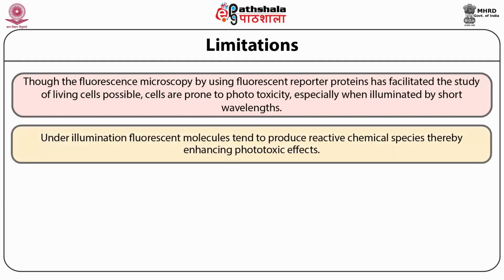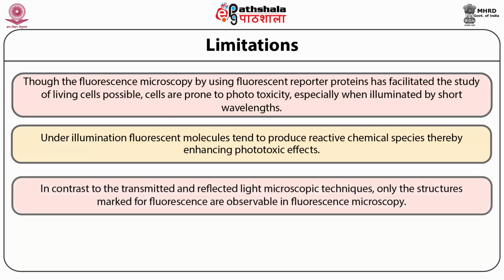Under illumination, fluorescent molecules tend to produce reactive chemical species, thereby enhancing the phototoxic effects. In contrast to the transmitted and reflected light microscopic techniques, only the structures which are marked for fluorescence are observable in fluorescence microscopy.